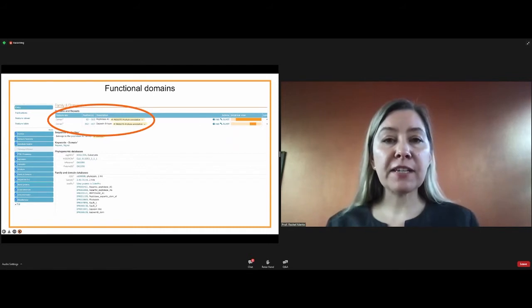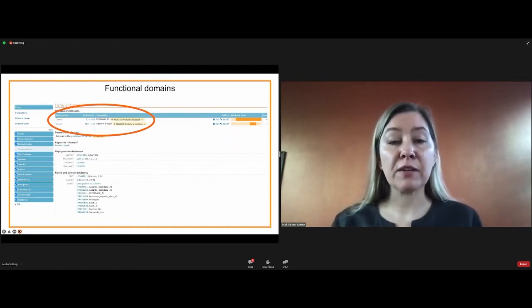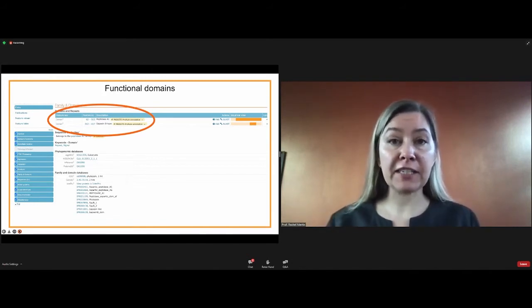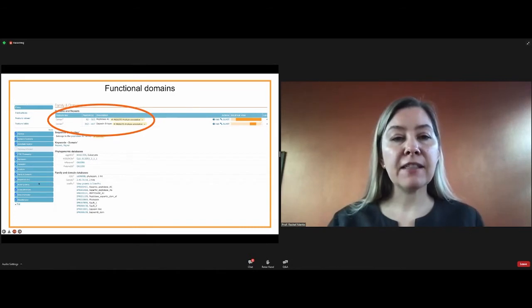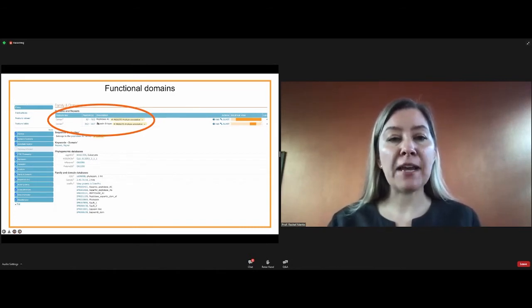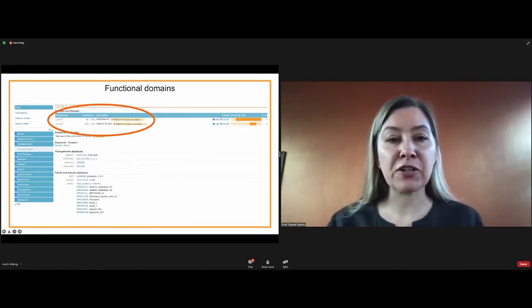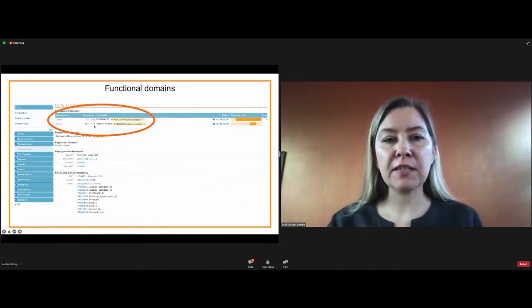It also gives us some information about the different domains of the protein that have been identified. A lot of times, proteins have different functionalities that are stuck together. This one has a domain that is peptidase A1. That's our protease that serves a digestive function. Then it also has this other thing in the middle. Notice this is in the middle of that one.